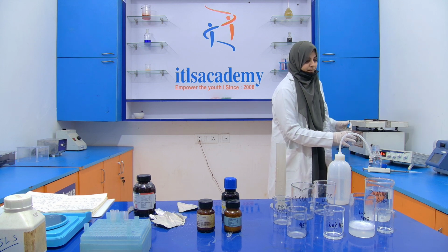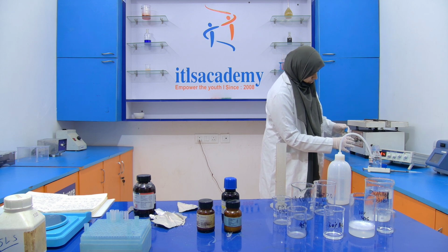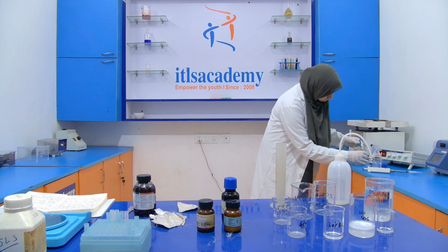Still more NaOH will be added because it reaches only 8.12.